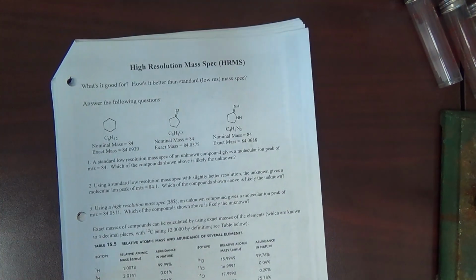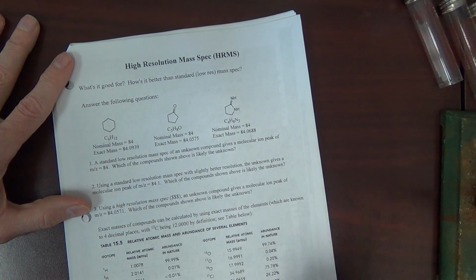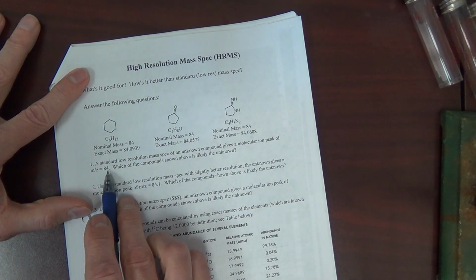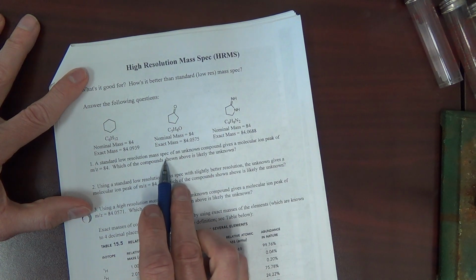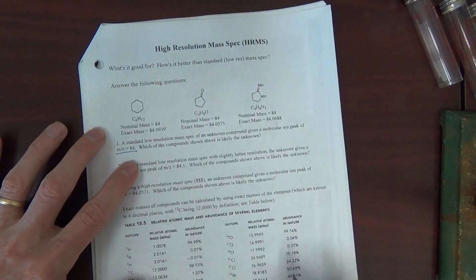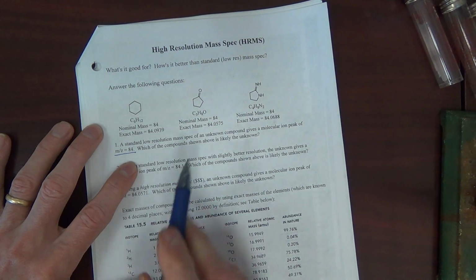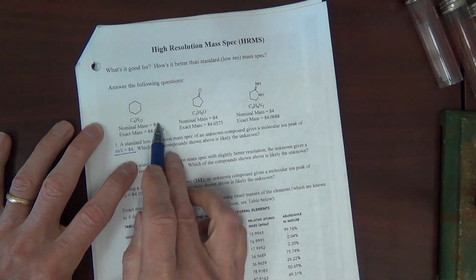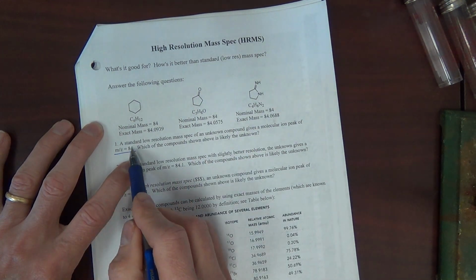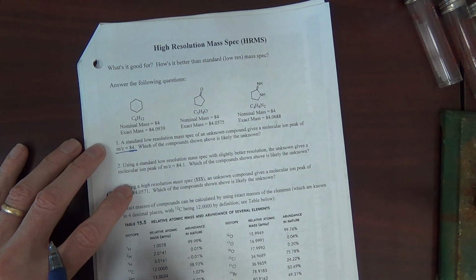Okay, last thing, high resolution mass spec. This is where you use 4 decimal places. For example, answer the following questions. A standard low resolution mass spec of an unknown compound gives a molecular ion peak of 84. Low res, nominal mass. Which of the above compounds is the unknown? The problem is, all 3 of these compounds have a nominal mass of 84. If you look at it, add it up. So this 84 does not give you an answer.